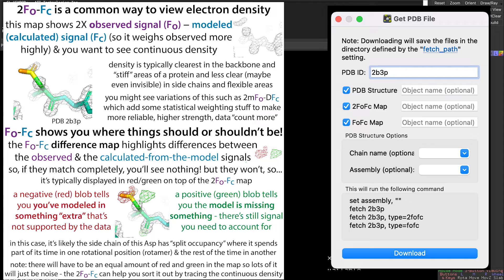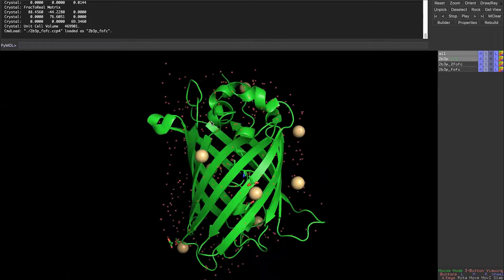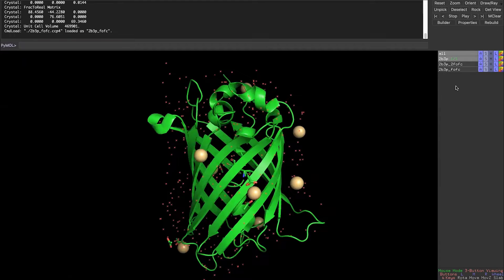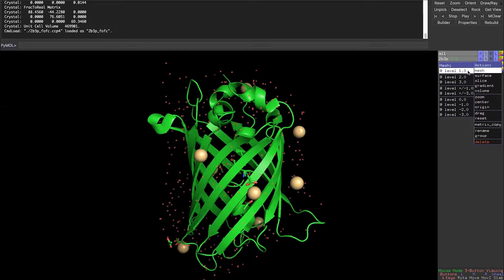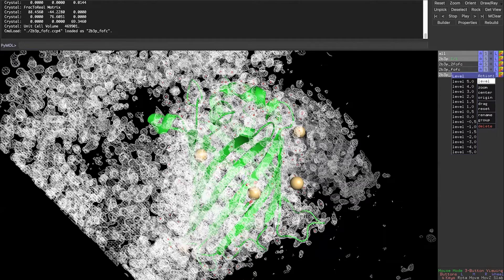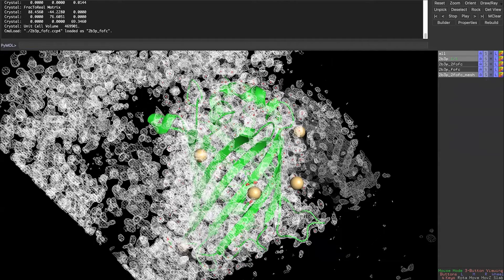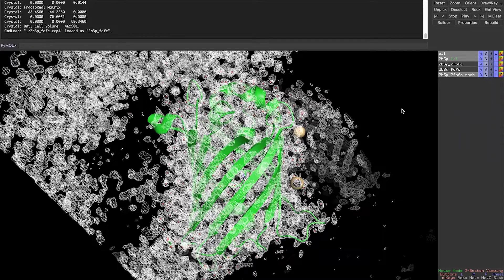You can download both maps here. You can also specify things like the chain name if there are multiple proteins and you only want a single one, or things like the assembly — for example, if the protein acts as a dimer and the authors have made an assembly in dimer form. Once you download, you'll see the structure but not the maps yet. To actually see the maps, you need to go to Action > Mesh, set the mesh, and then you can modify the level via Action > Level, slab it, and things like this. We're also going to change it from cartoon mode to stick mode so we can better visualize how well the density fits, since in cartoon mode it blends everything together.